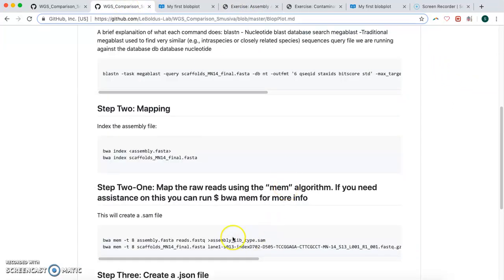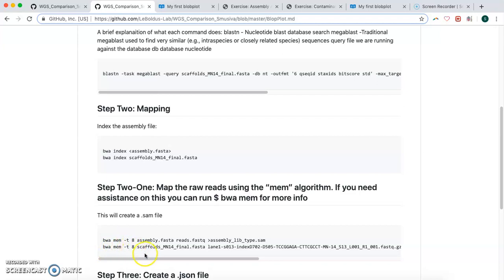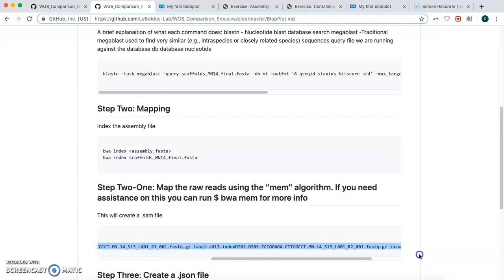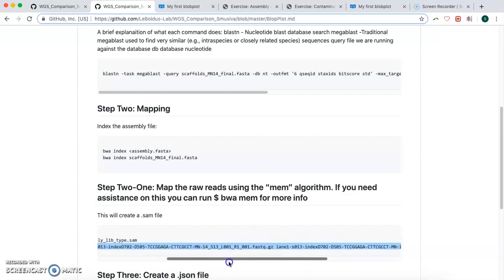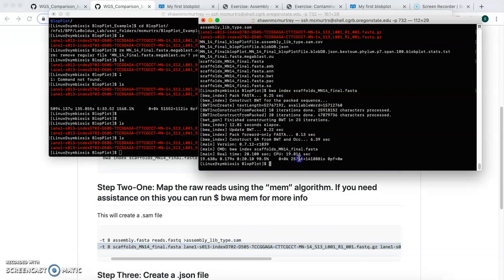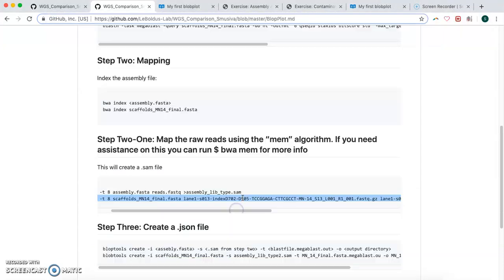We're using that program to create the, to use the bwa algorithm, which is this command here. And it's going to create a .sam file. So we would normally copy all that, change our files accordingly. It's our two reads file and our assembly file. That step does take a while, so I'm not going to run that one either.